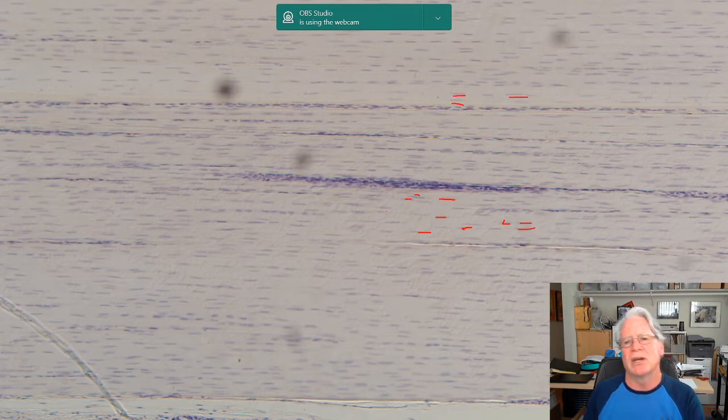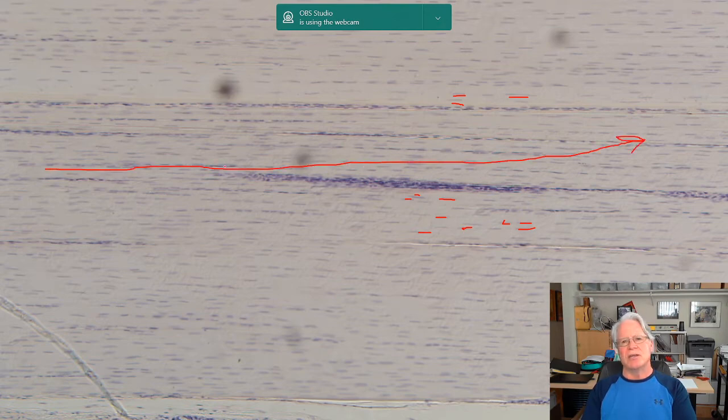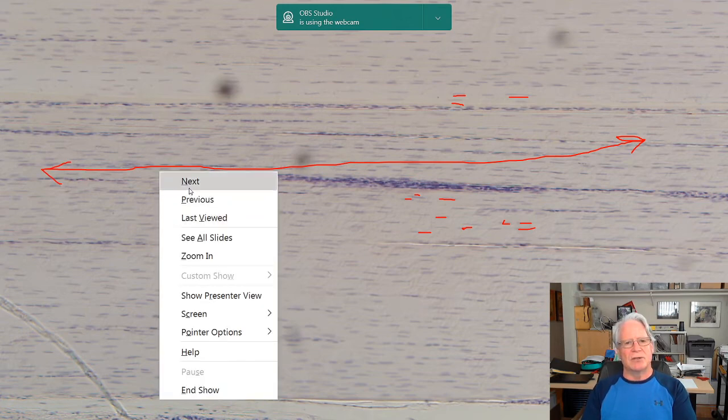So these dark things that you see here, those are the fibroblasts embedded between the fibers. So they're all lined up in the same direction because the fibers are all lined up in the same direction. So we get these dark slashes all lined up, river of worms. That's the way I like to think about this tissue. If you see that pattern, you're talking about dense regular connective tissue because the fibers are running in this direction here, because that's the direction of stress. Okay? So dense regular connective tissue.